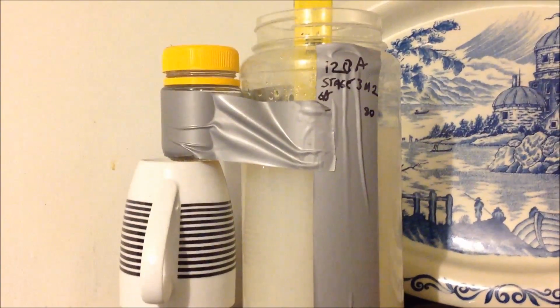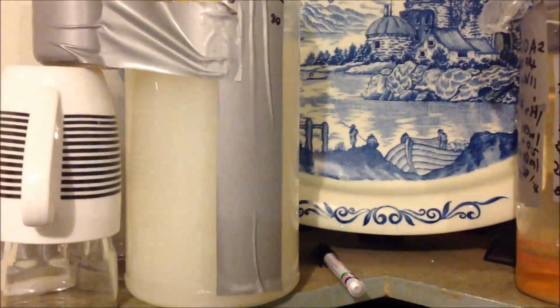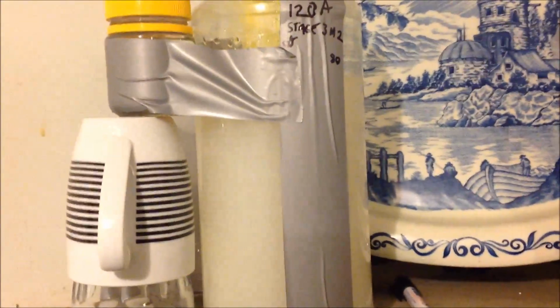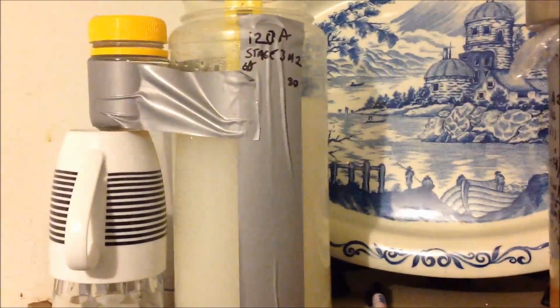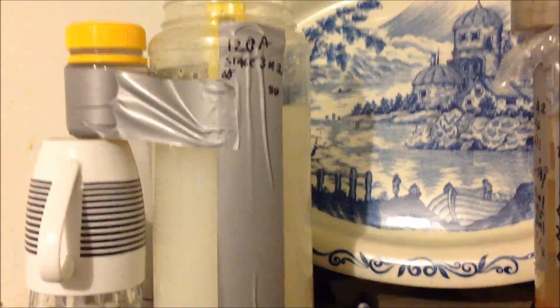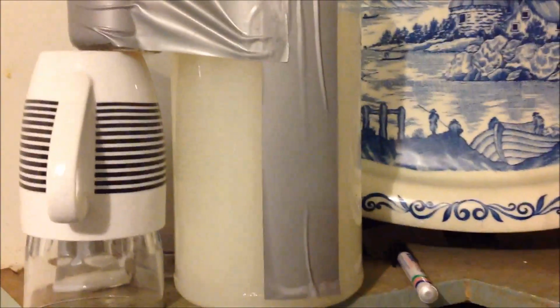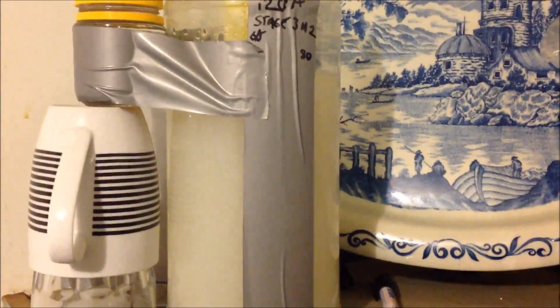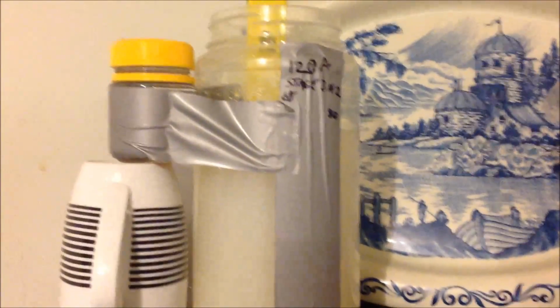It's taken about 130 mil to get to there, which I thought it was going to take, because I added up how much sodium hydroxide I'd used previously, so I knew it was going to take about the same amount to undo what had been done. So I've got my piggyback of sodium hydroxide on there, but I can't use it. I've really got to decide what I'm going to do about this suspension. I might leave it for another 24 hours and just watch it, because the pH is moving a little bit, and see what happens then.